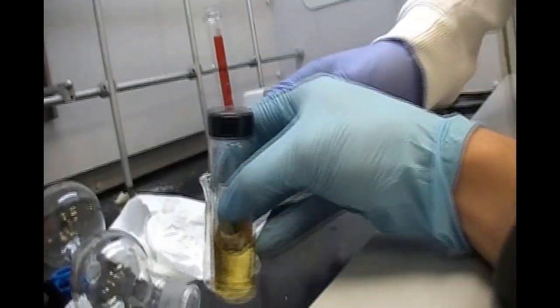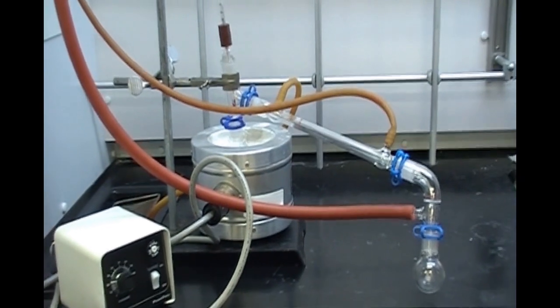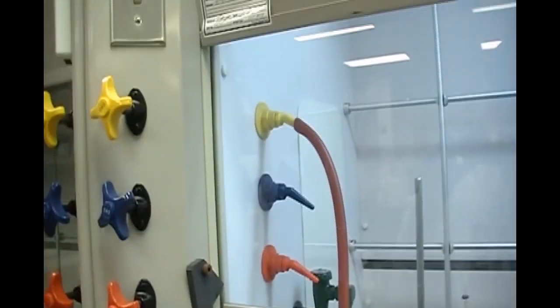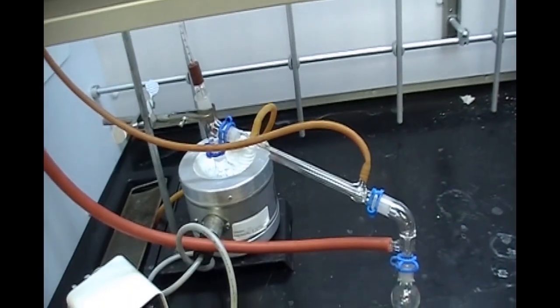The final step was to purify using distillation. The entire setup included a vacuum portion of the distillation setup in order to ensure that the desired product was reaching the collection flask only. However, due to there being only a few compounds in the initial round bottom flask, we opted to not use it as it likely wasn't necessary.